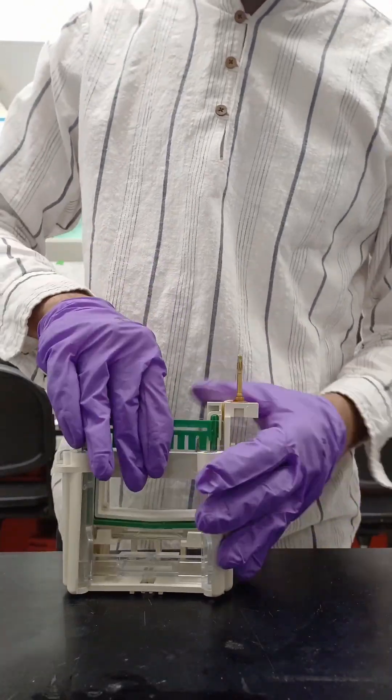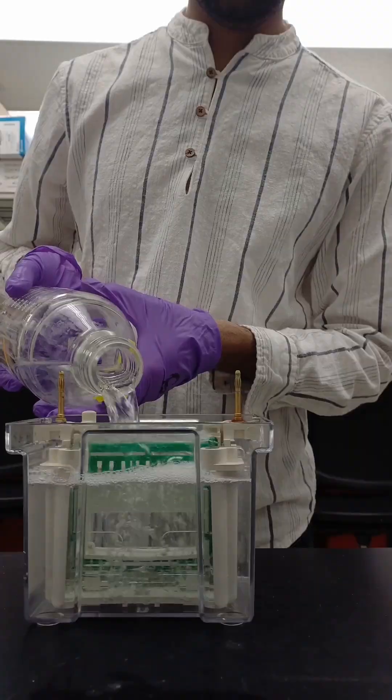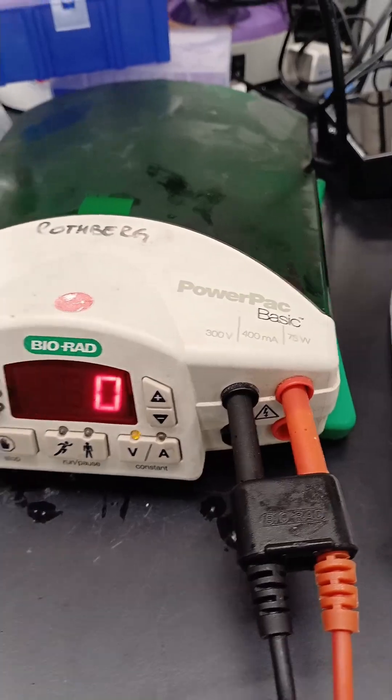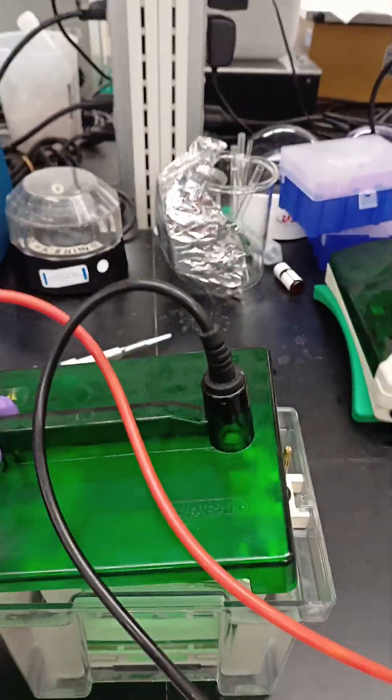Once solidified, set the gel in the tank and fill it completely with SDS running buffer. Load your samples carefully. Before you start, double check your wires red to red, black to black.